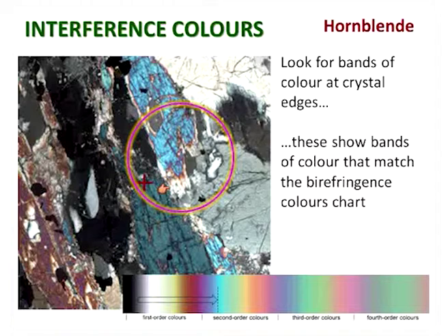And you can follow then through the thinnest part of the crystal, which has the lowest order colours, through white up into yellow, and then orange and red, and what we call the sensitive tint, which is this kind of glorious pink colour, and then through that and into the highest order colour, which is this kind of palish blue. And I've marked that on the chart at the bottom here. You see you start off in a kind of pale grey, and you go through the white, you hit the yellow, and then fairly rapidly through the red and the pink, purple, and then up into that pale blue, that sort of pale sky blue.